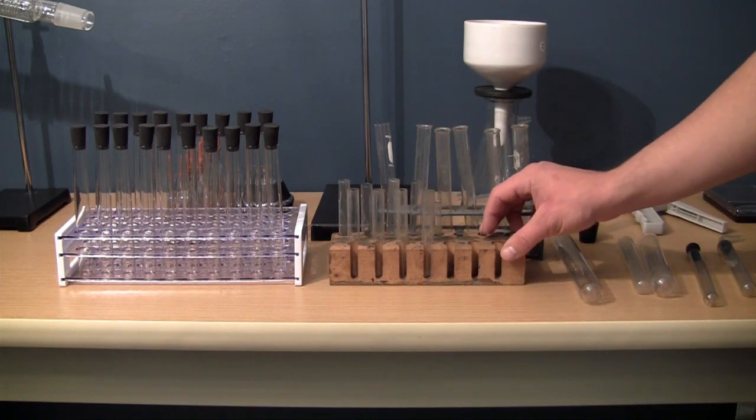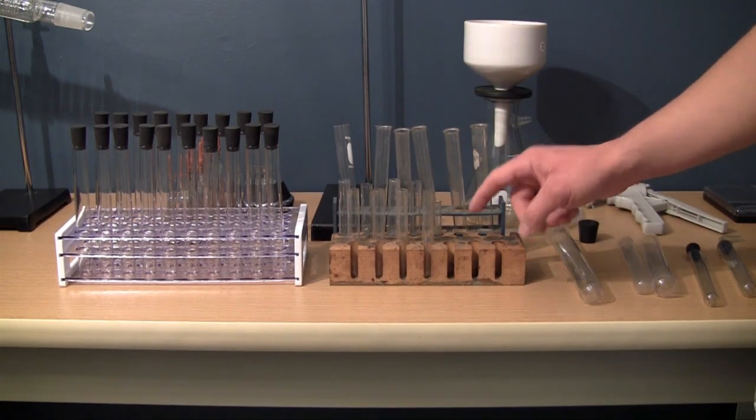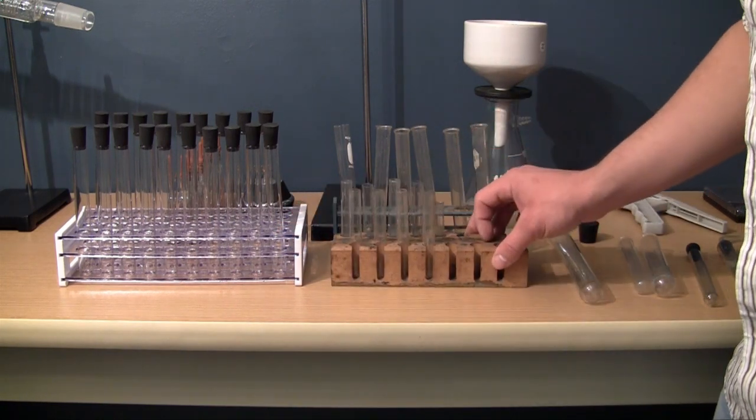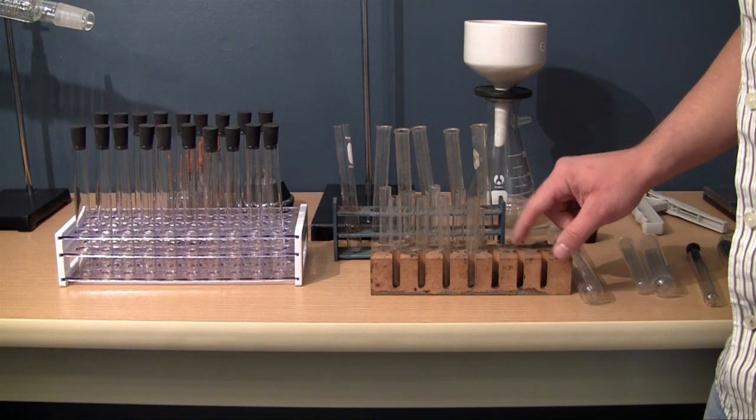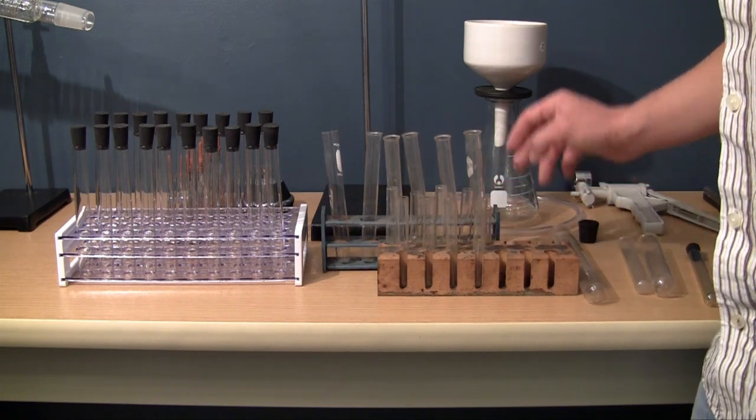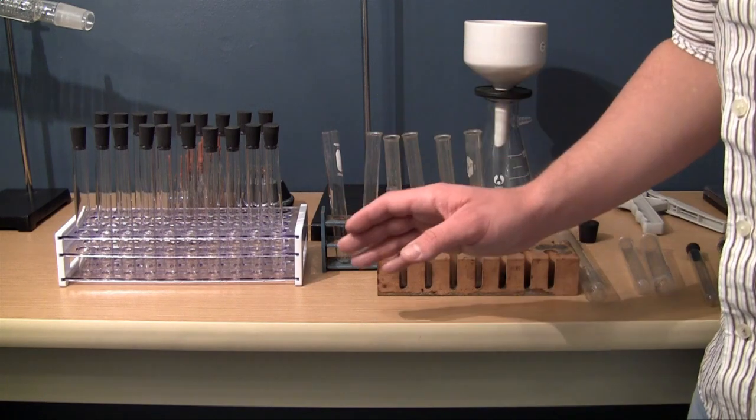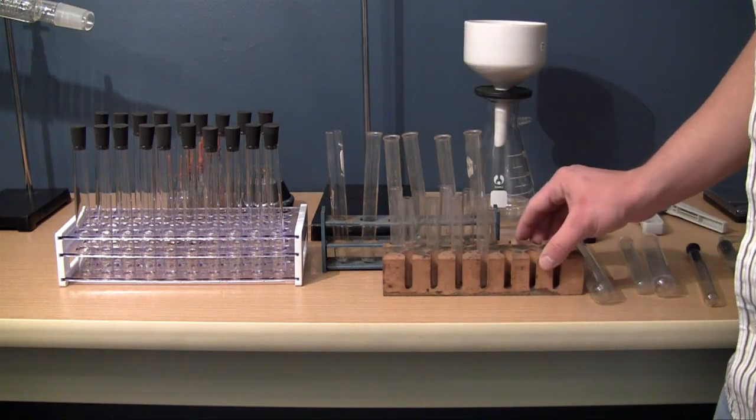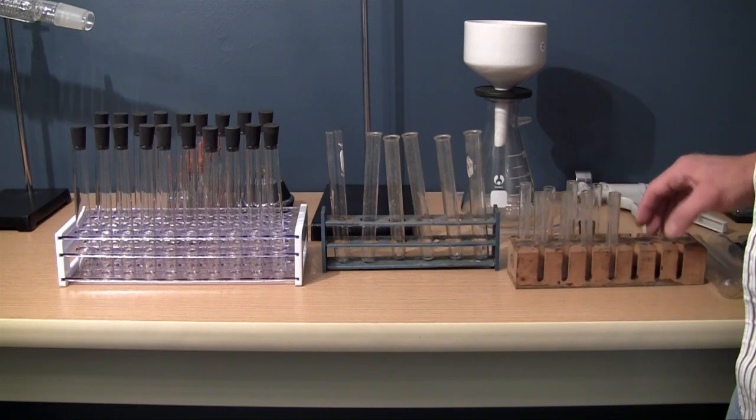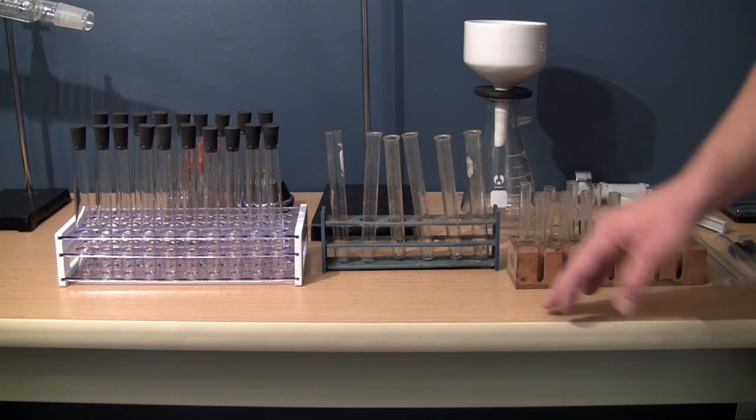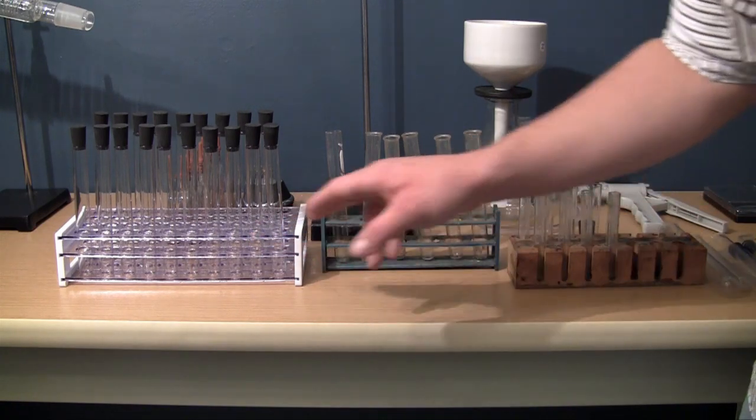And another thing that you definitely want to do is you want to get some kind of test tube rack. This is probably my favorite one, this is an old wood one that I got from actually someone that used to be my science teacher, and this is another rack. But you want a rack because it's a lot easier to store your test tubes and also whenever you're just observing chemical reactions, you can line them up nice and neat and it's a lot easier to observe if you have a rack like this.